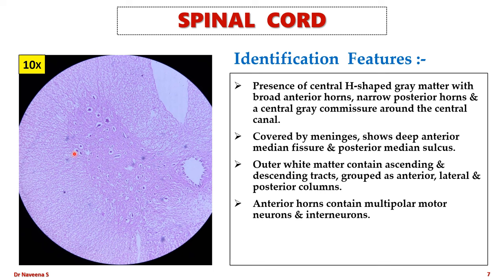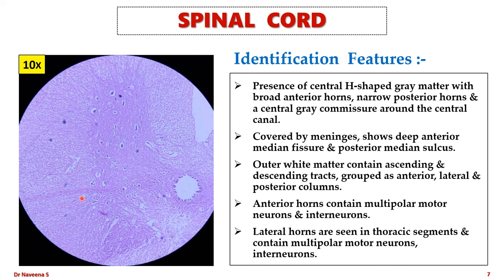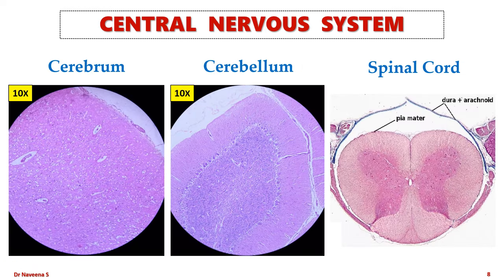In the anterior horns of grey matter there are multipolar neurons and interneurons. Under low magnification, the broad anterior horn shows larger multipolar neurons and smaller interneurons. In the thoracic region, spinal cord shows lateral horns which also contain larger multipolar neurons and smaller interneurons. To summarize the three CNS slides: cerebrum is identified by pyramidal cells in six cortical layers; cerebellum by cerebellar folia and larger Purkinje cells in three cortical layers; and spinal cord by H-shaped grey matter with broad anterior horns and narrow posterior horns.